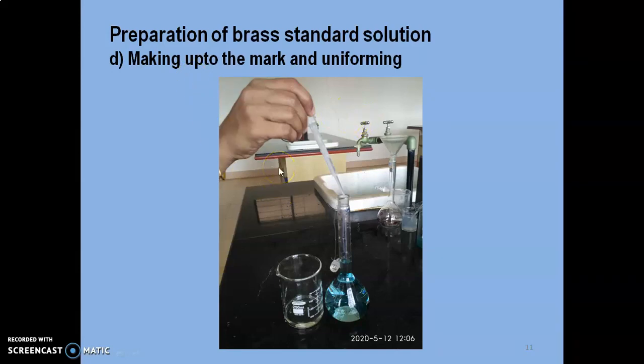Later, it has to be made up to the mark using distilled water, to the mark given over here, and it has to be tilted to make the solution uniform.